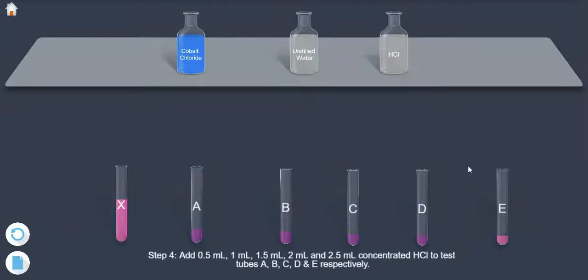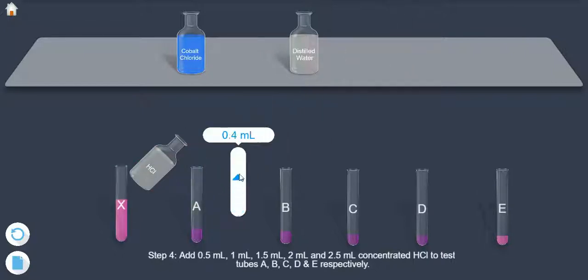Add 0.5 ml, 1 ml, 1.5 ml, 2 ml and 2.5 ml concentrated HCl to test tubes A, B, C, D and E respectively.